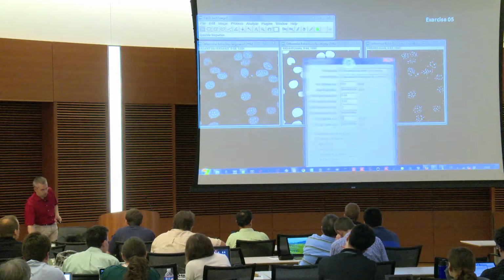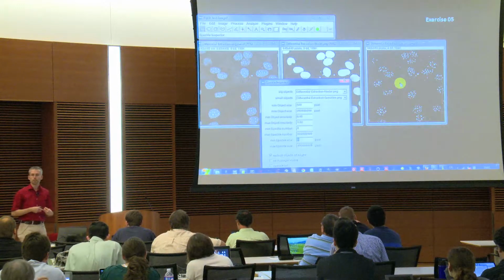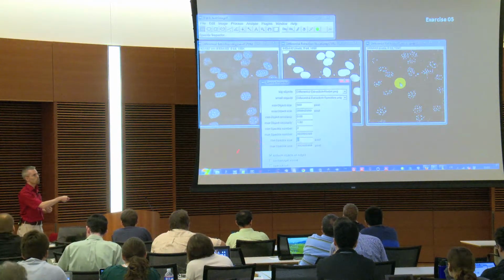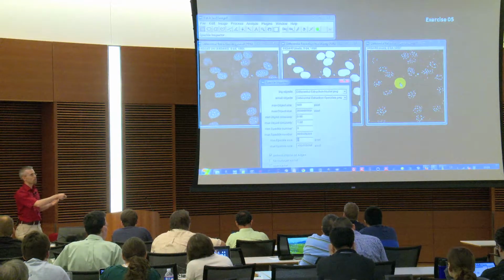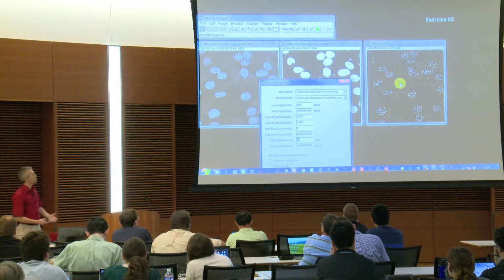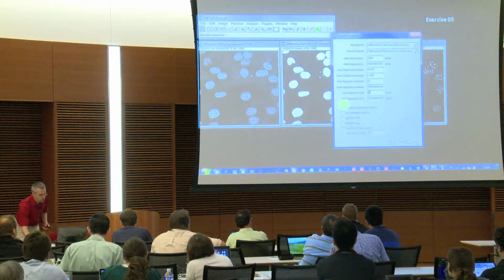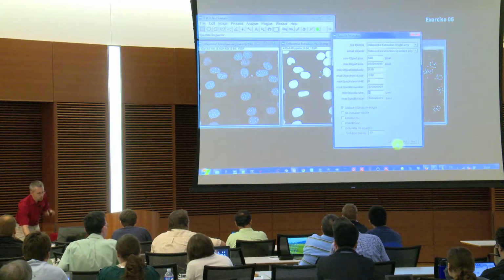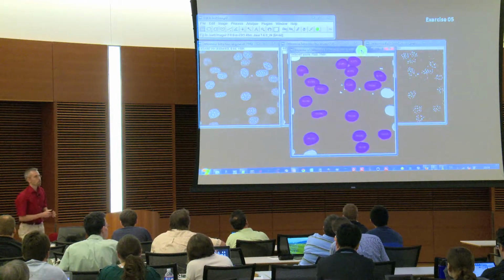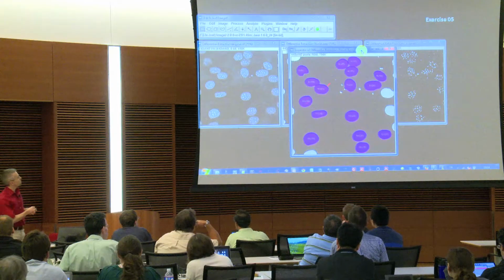The minimum size of the speckles, because also here you might have things which you want to exclude by size from the small ones. This is basically what you would do here. But here, every one of those spots really corresponds to a spot in the original image, so we don't exclude here, but you could do so. And we exclude edge objects here, that's important. So now we simply run that, and you see what you get out first. In the first place, you should at least get that. If somebody doesn't get that, then tell me, I need to fix that.